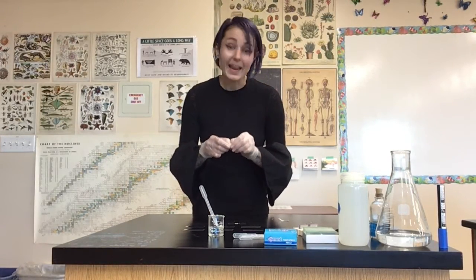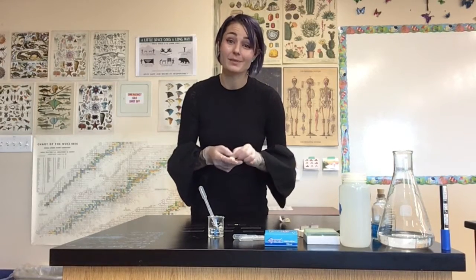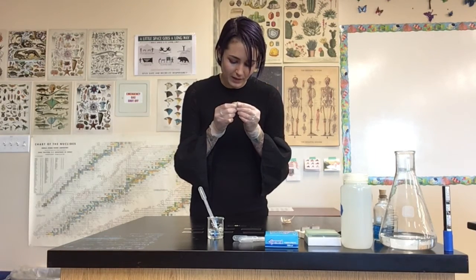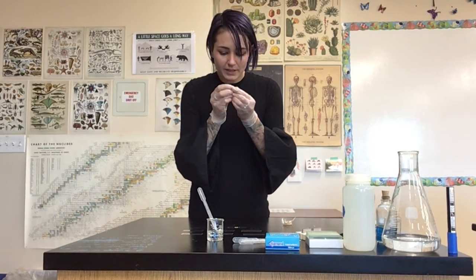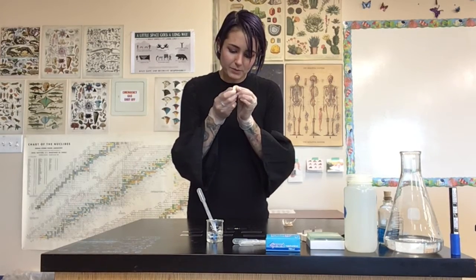we can get access to the cells enough to get some pictures of what's going on in there, because once again we want to catch it doing mitosis. So I have my clove of garlic here, and it actually looks like there's some cell replication going on at the base. I can see some new sprouts emerging.